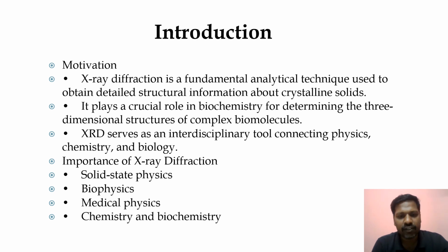X-ray diffraction is a fundamental analytical technique used to study crystalline solids. It is very important because it tells us the crystal structure of a material. It is widely used in physics, chemistry, biology, and medicine. Even complex biological molecules like DNA were studied using XRD. So XRD acts as a bridge between chemistry and biology.